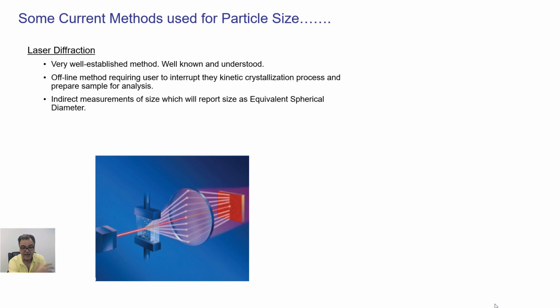That's a dynamic process, and do the preparation and suspension to actually analyze it in laser diffraction instruments. So that's a bit of a challenge, because it's a growth process. The crystals keep on growing. You might be changing the environment it's in when you're doing the analysis with laser diffraction. So there has always been some concerns. Still, it's a very popular tool because it's so well established.